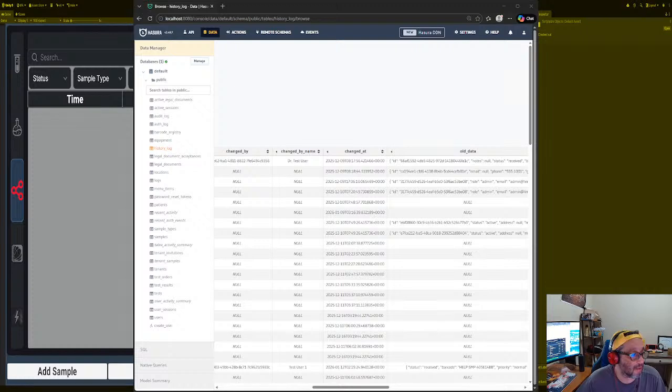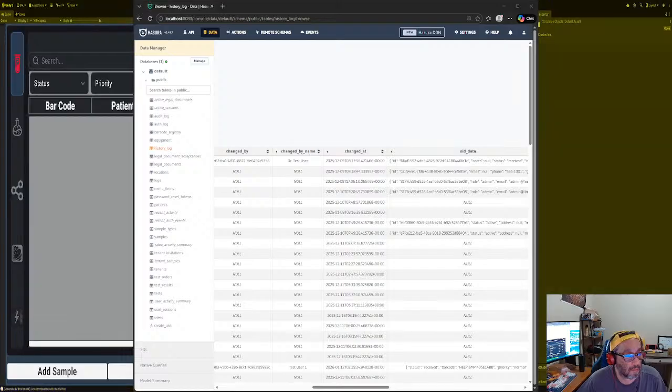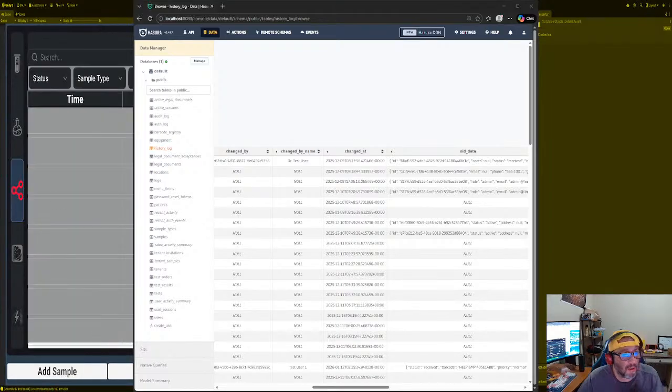All right, we're loading up here. Hopefully we got all the column names correct this time. There we go. So we got the recent time. The times aren't showing up though. I wonder why it wasn't showing up. Let me look at it.